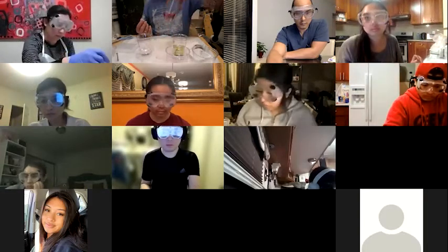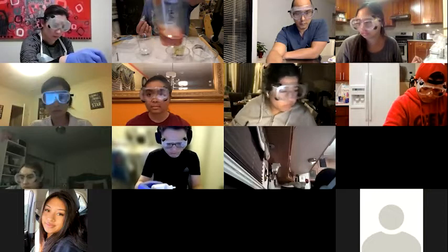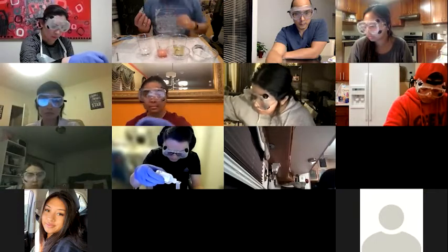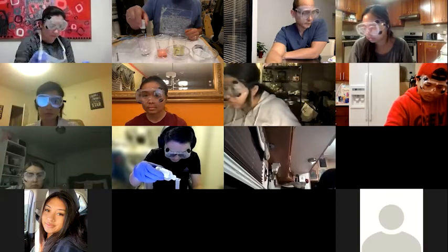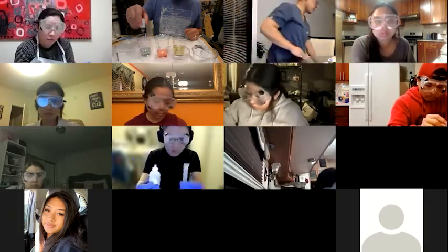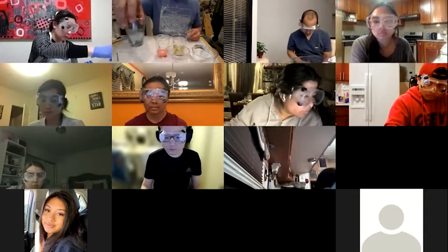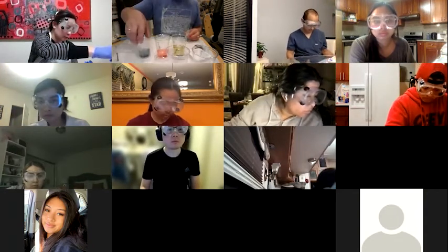Cool. Get a nice pink color for the acid. Let's see what color the conjugate base is going to be. 1, 2. Ooh, and a pretty blue, sort of turquoise color, or aqua.